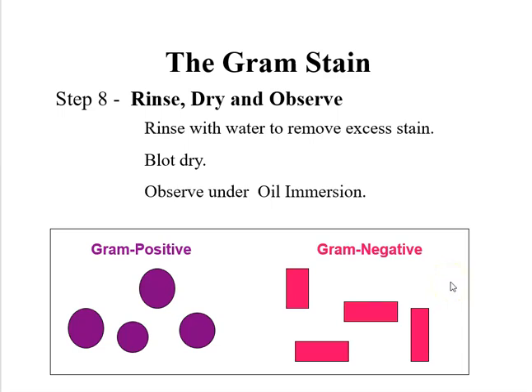And so when you report out a gram stain, you report out the gram reaction first, and then the shape. So gram positive cocci, and then in chains or in clusters, diplococci, gram negative bacilli. Okay, you can have gram positive bacilli, I assure you.